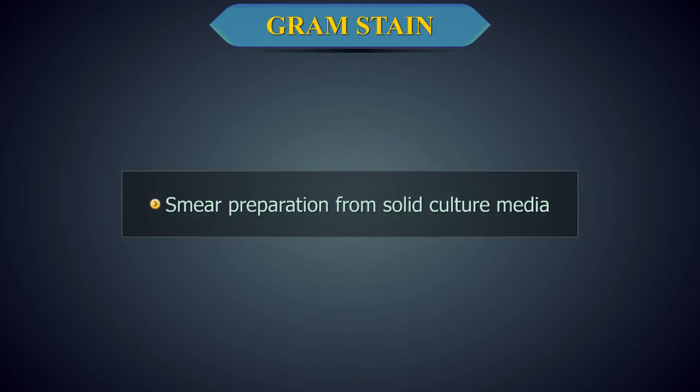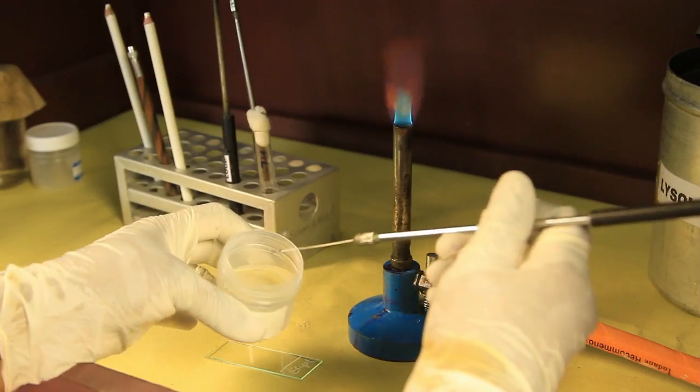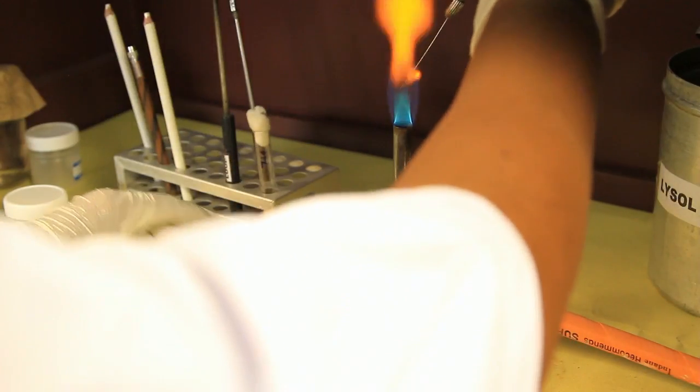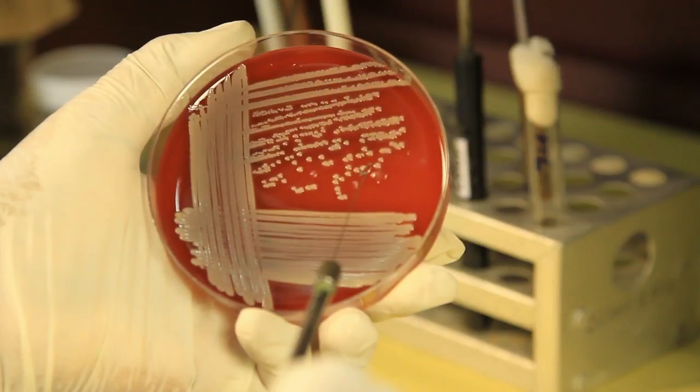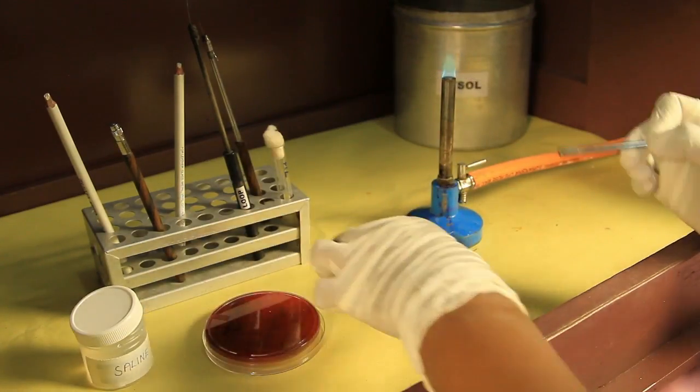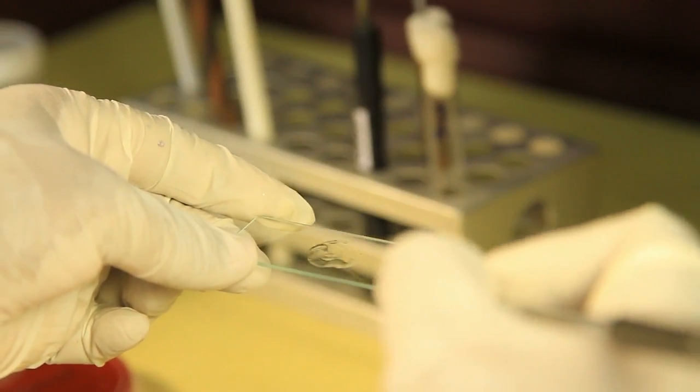Smear Preparation from Solid Culture Media. Take a loopful of normal saline and smear it onto the middle of a glass slide. With a sterile inoculating loop, pick a colony from the culture plate and emulsify into the saline while spreading the smear. Let the smear air dry.